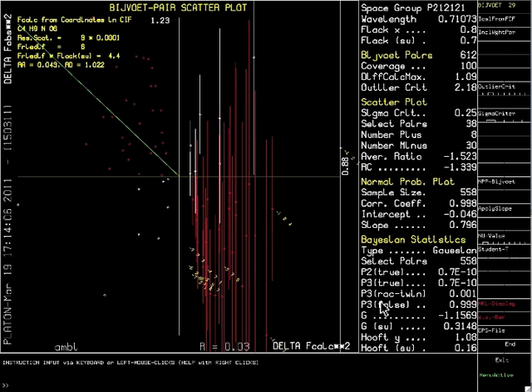Sometimes, Platon will not calculate the p2 and p3 values. This will happen when Platon detects that it is very unlikely that the structure is indeed a pure enantiomer or a 1-to-1 racemic twin.